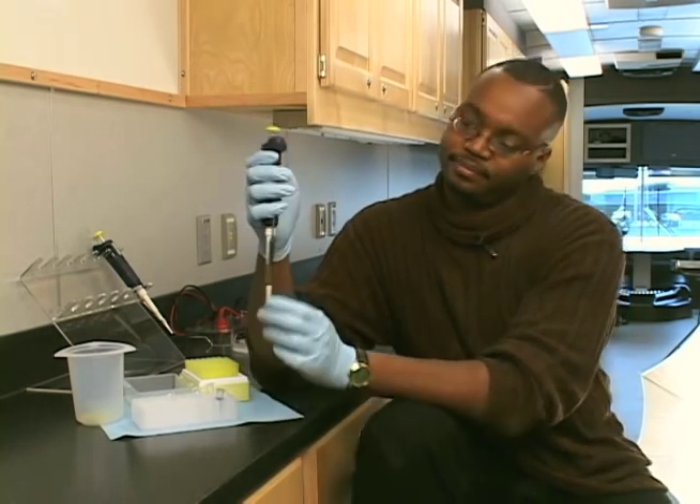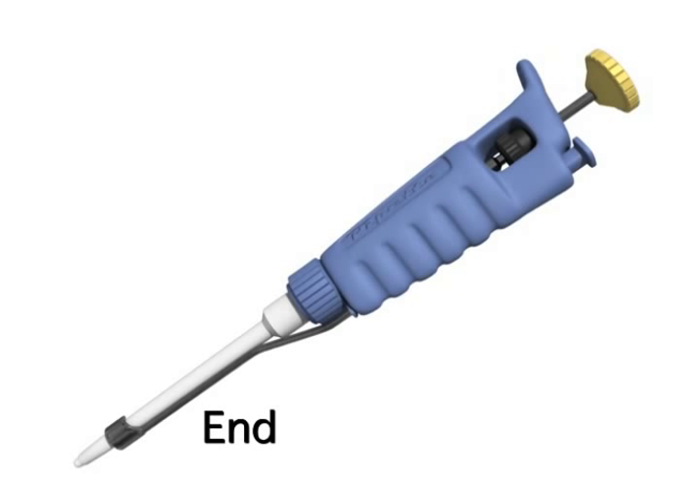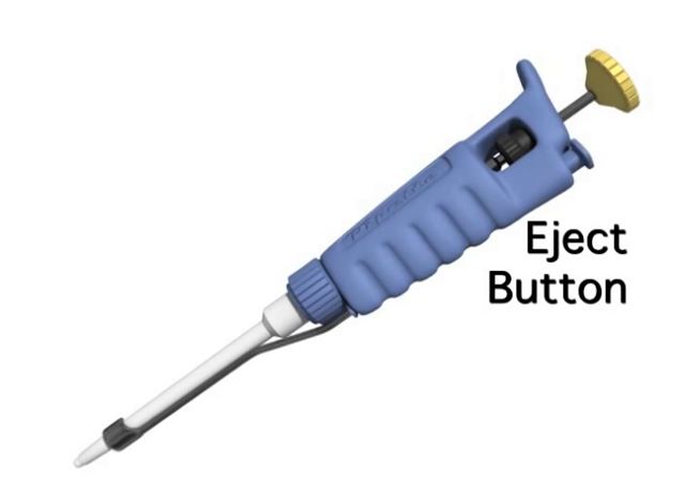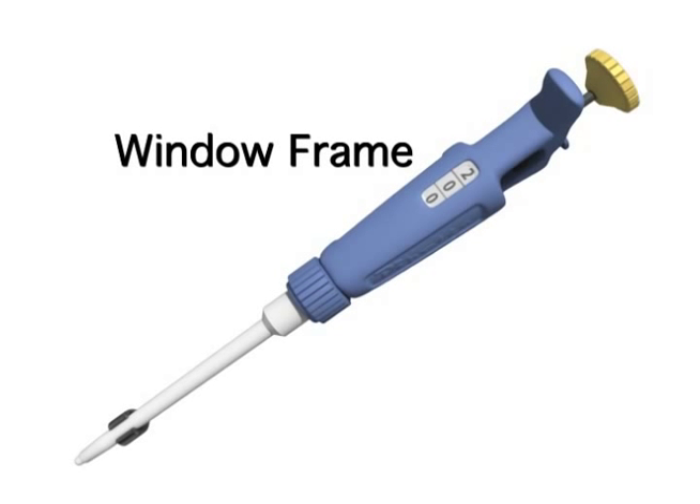What are the parts of the pipette? We have the end of the pipette, which is where the pipette tip gets added onto the pipette. We have the body of the pipette where you put your hand around to hold it. You have the plunger that goes up and down, and you have the eject button that also goes up and down. You also have a window frame that shows you the volume of liquid that you use for your pipette.